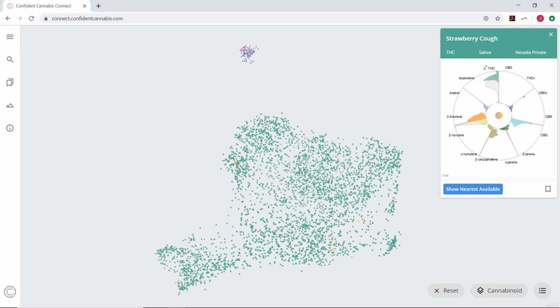And what that means is when you're separating these compounds out in a chromatography column, whether it be on a gas chromatograph or high pressure liquid chromatography system, sometimes THCV and CBDV can separate at the same point that some terpenes would separate. So when I see values like this of CBDV showing up in a high THC sample, that may be accurate, but just be aware that it also may not be accurate. I mean, at this point, with where cannabis testing is in the industry, I just don't put too much stock in THCV and CBDV numbers, and that's just kind of the way it is right now.